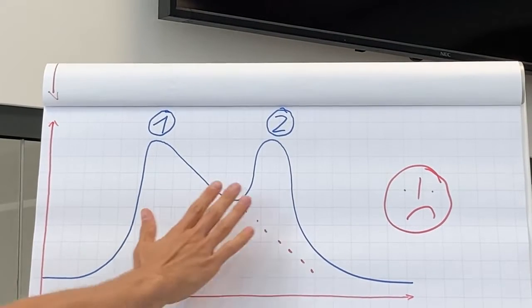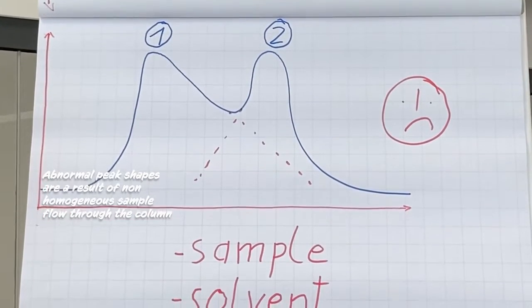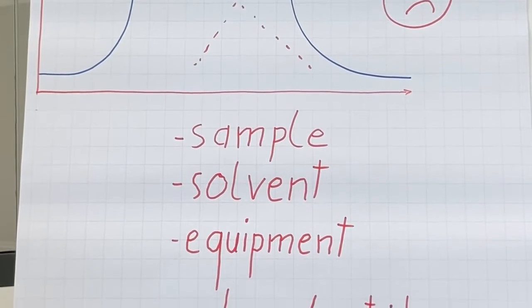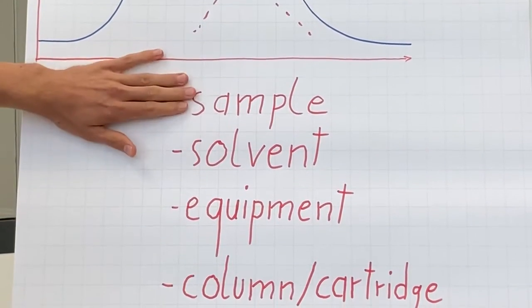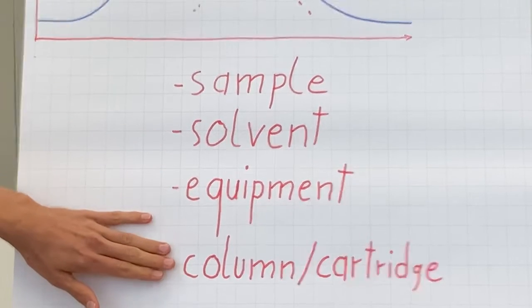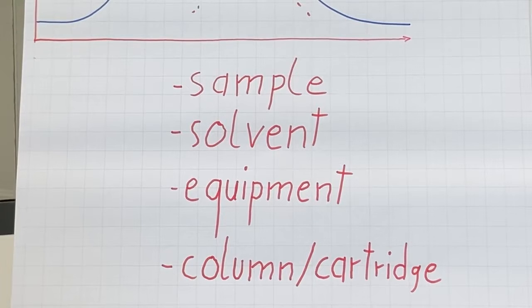Why do we get these peak shapes? In case of abnormal peaks, the sample does not flow homogeneously through the column or cartridge. This can be caused by the sample, the solvent, the equipment, or column or cartridge.